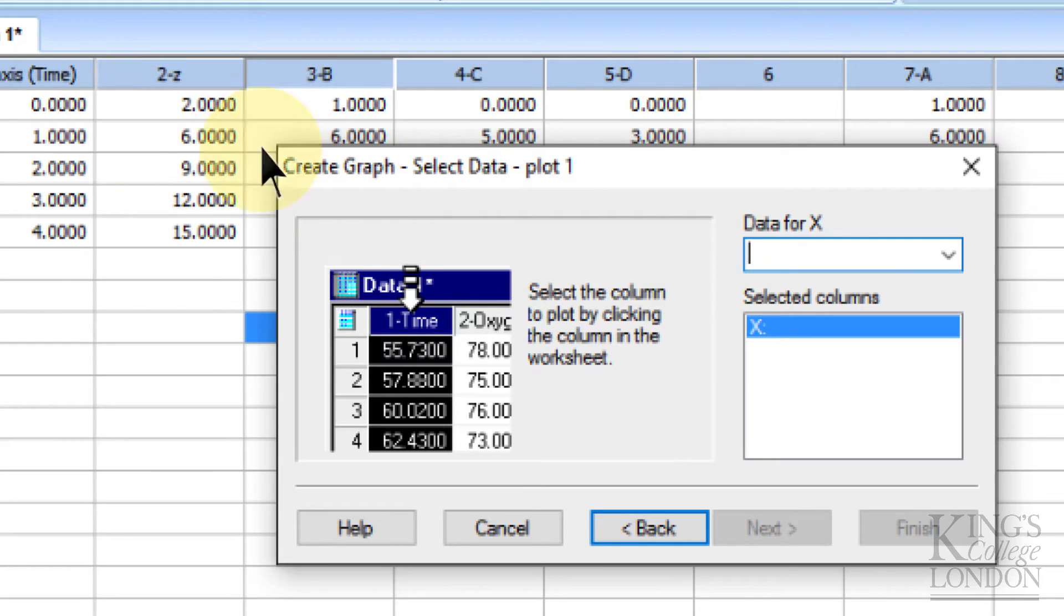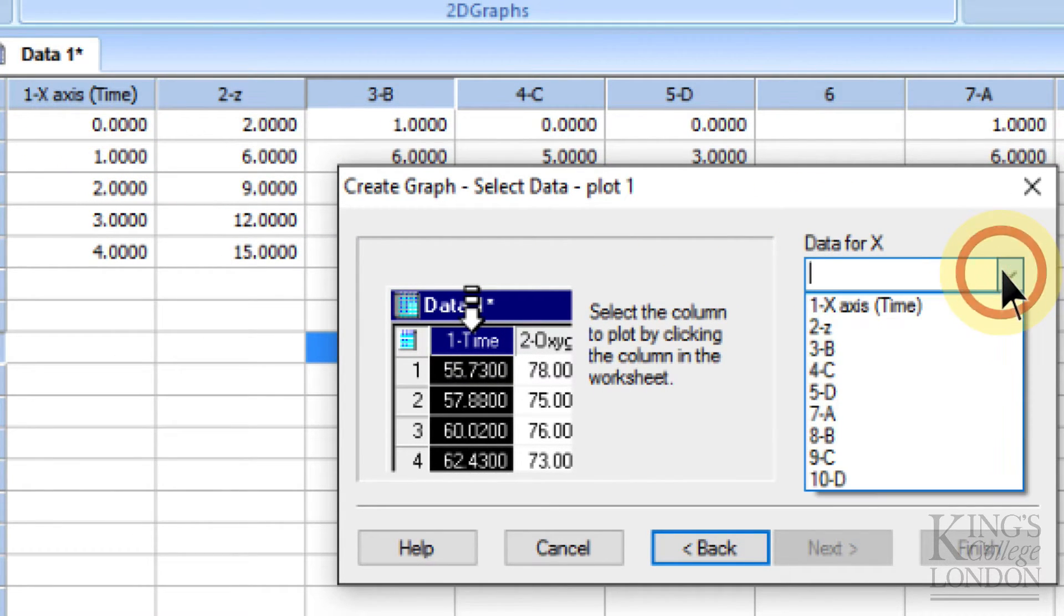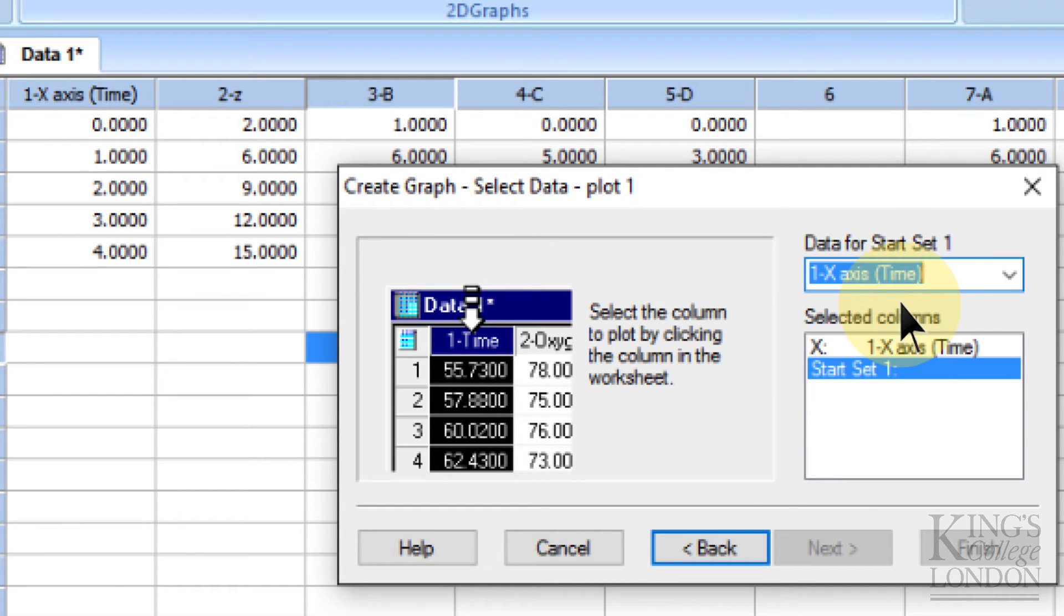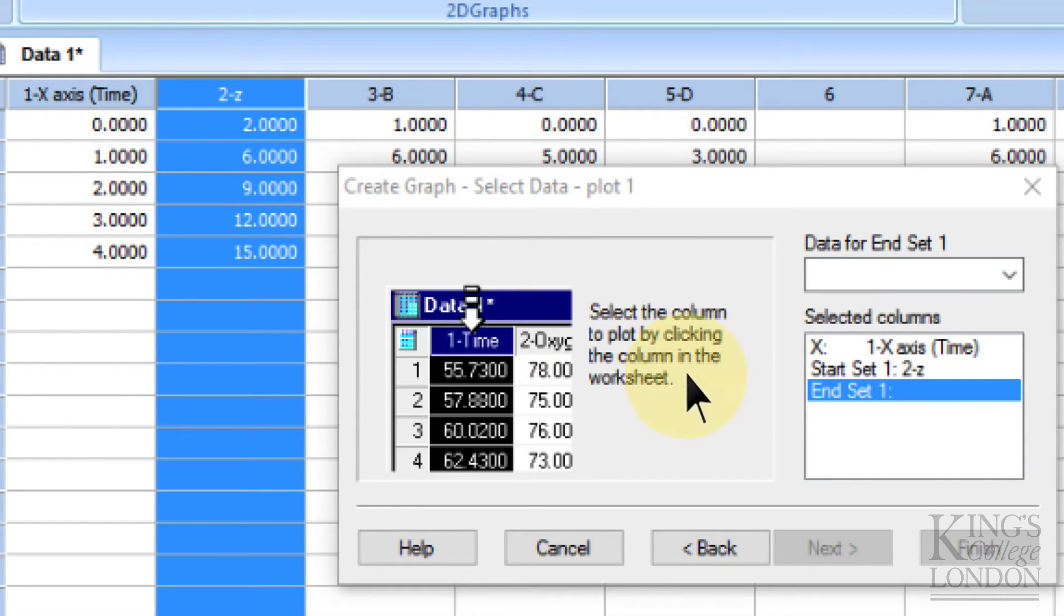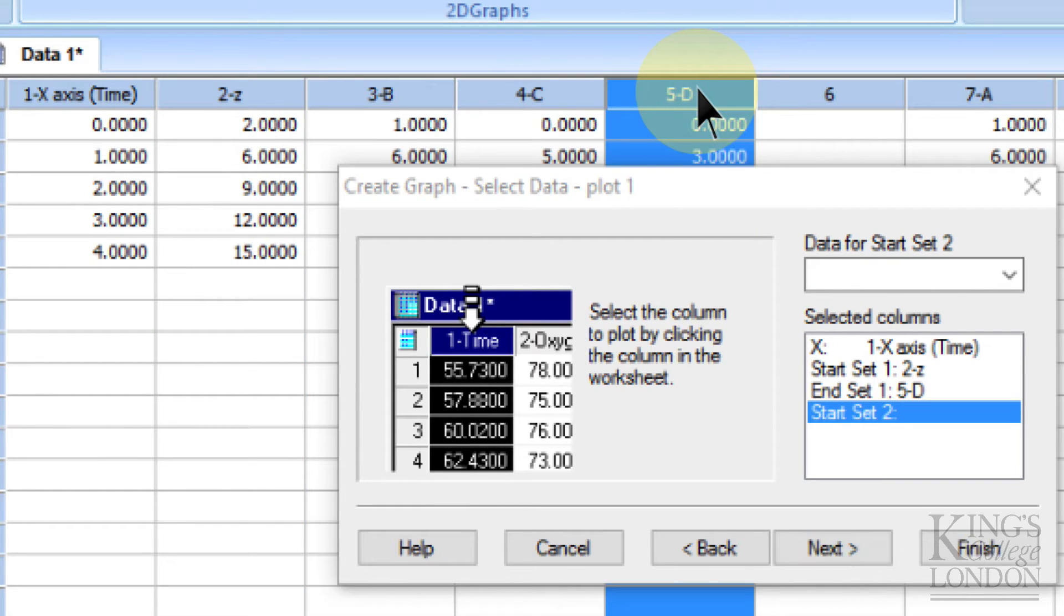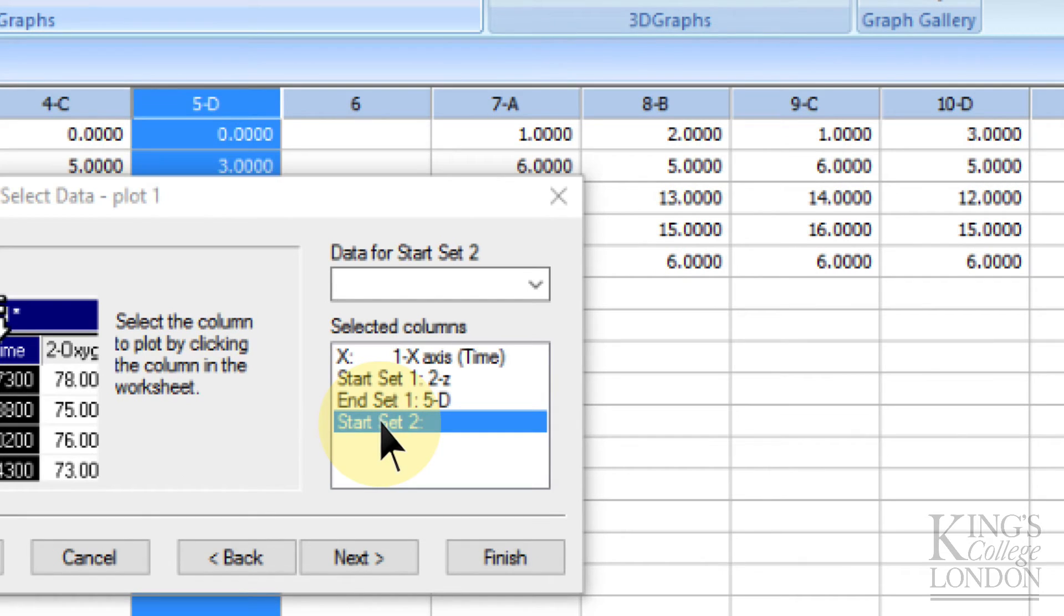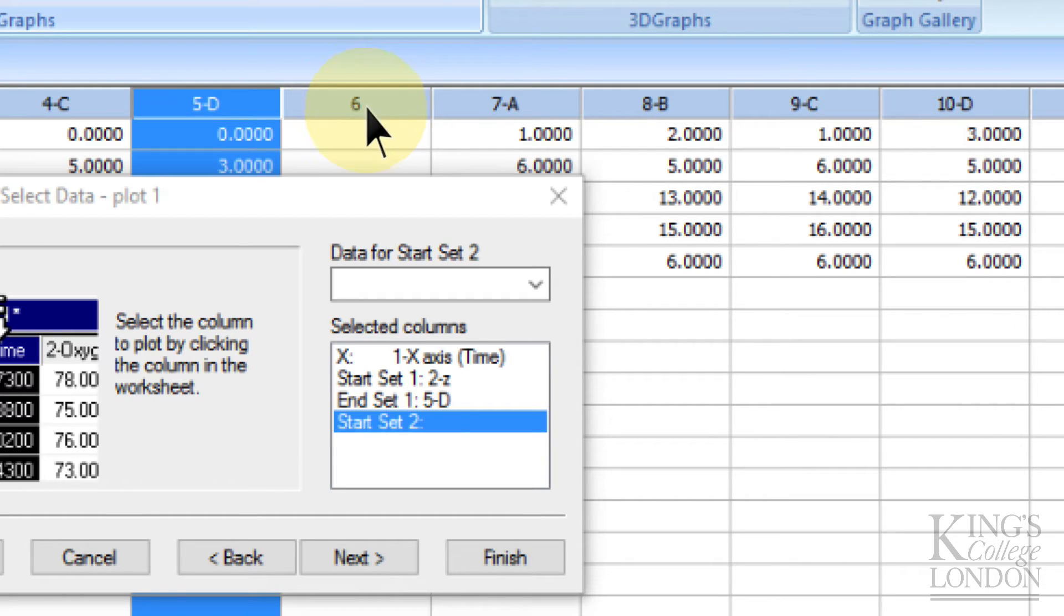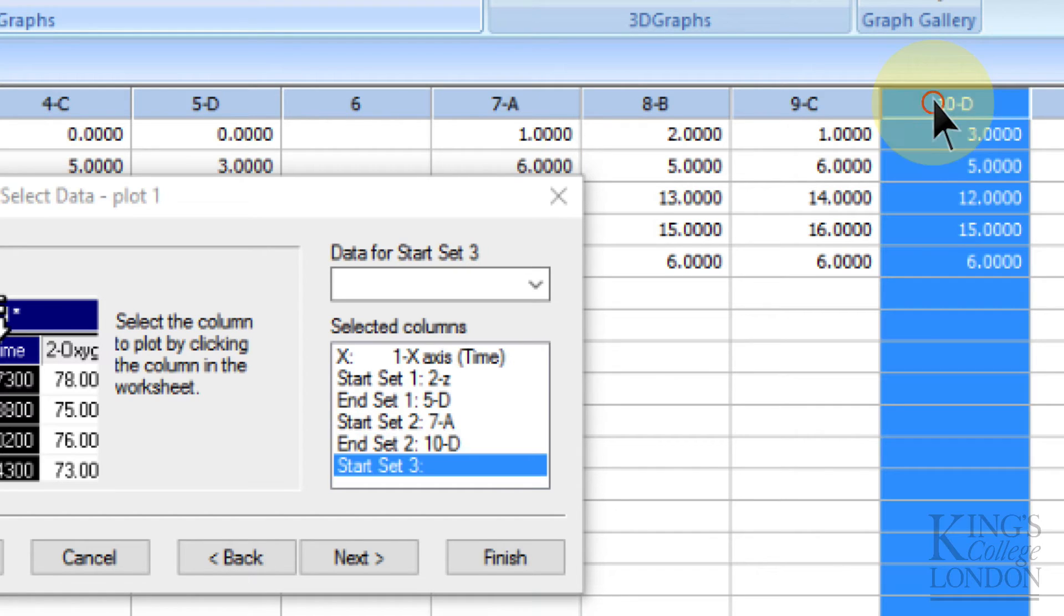Our data set from the x-axis comes from column number 1, so we can select this from the drop-down box as column 1. It then asks us where the start of data set 1 comes from, and we know this comes from the second column, and the end of data set 1 comes from the fifth column. It wants to know where data set 2 comes from. We've got a gap at column 6, just to make life a bit easier to show it on the screen. So we're going to choose column 7 as the start of data set 2, and column 10 in this case as the end of data set 2.